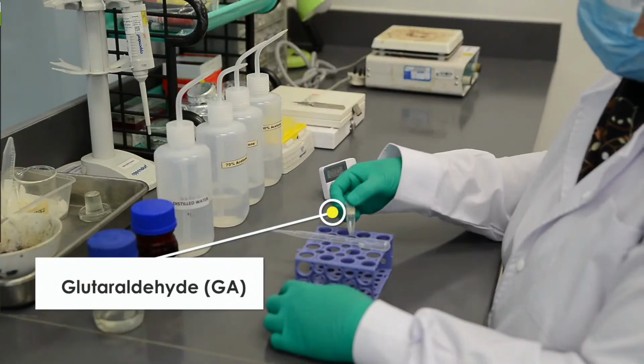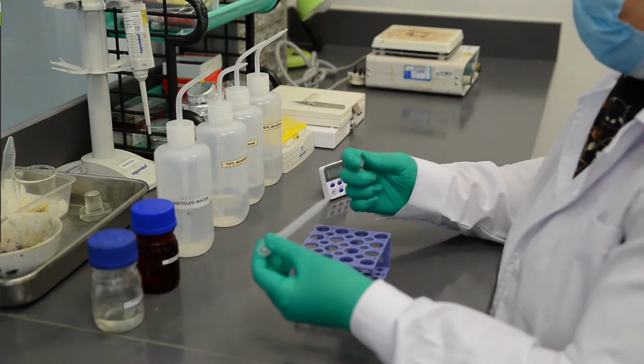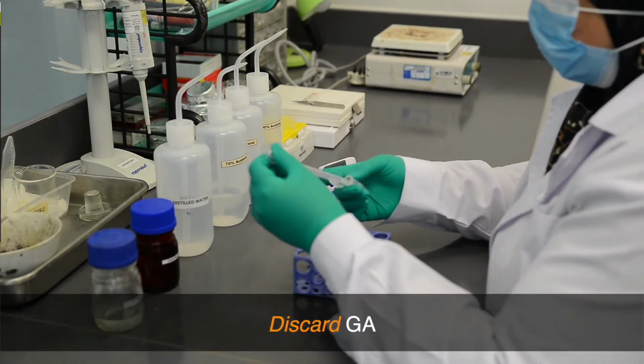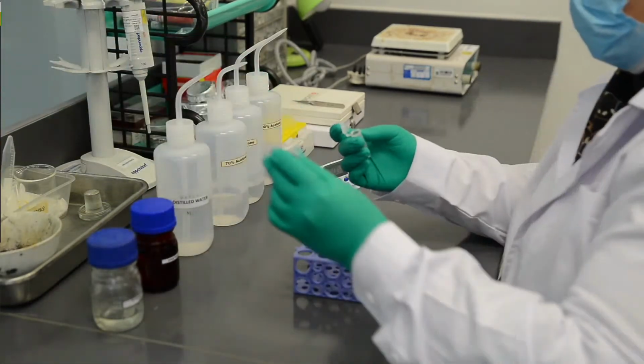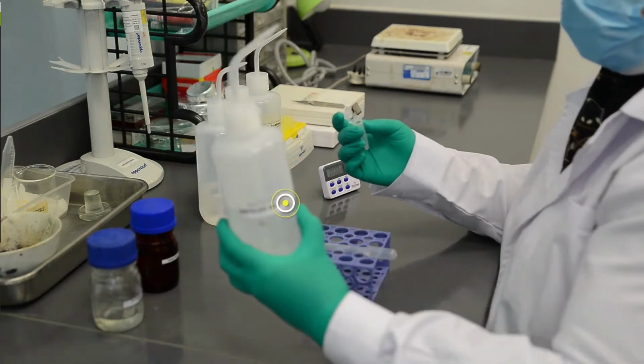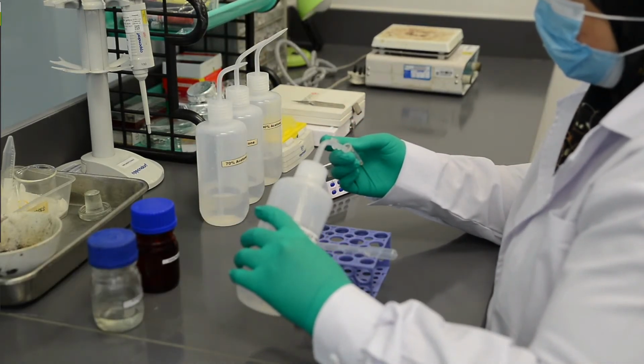We will receive the sample in glutaraldehyde. The sample will be fixed in GA. Once we receive it, we discard the GA. And then we wash the specimen with milli-Q water repeatedly, 6 times.